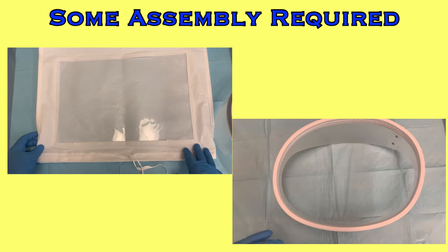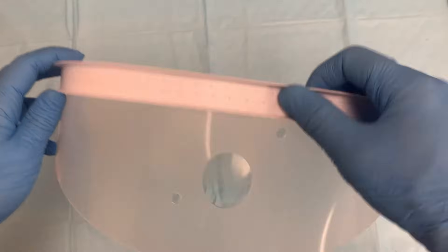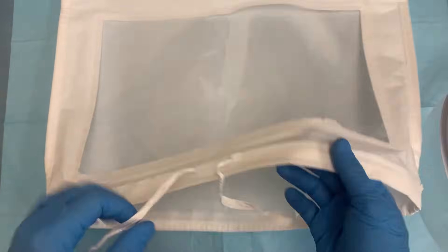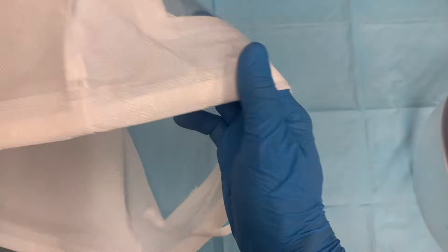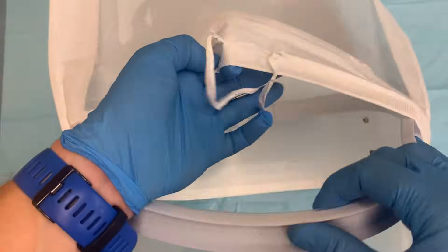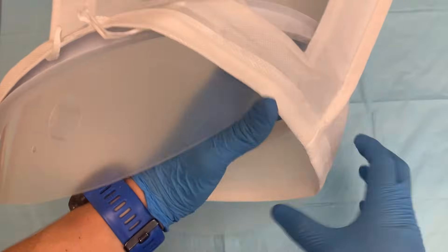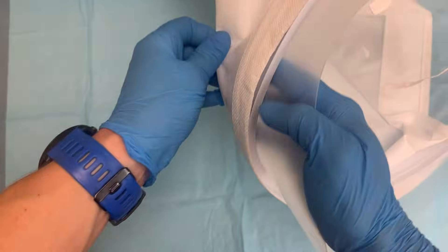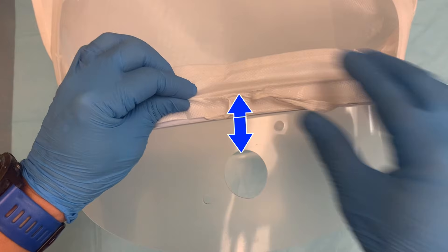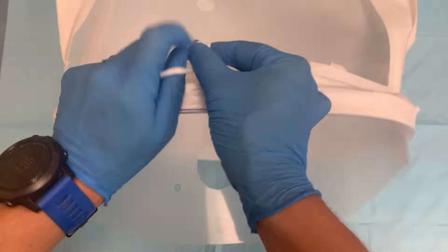Before you begin, you have to assemble some of your equipment. Take the hood and the collar. The collar has a groove around the top. Open the hood and notice the ties in the front — they are part of a strap that wraps around the entire base of the hood. Stretch the opening on the bottom of the hood over the groove on the top of the collar so the strap sits inside of the groove. Align the ties with the large hole in the front of the collar, and then tie the strap tight to secure the hood to the collar.